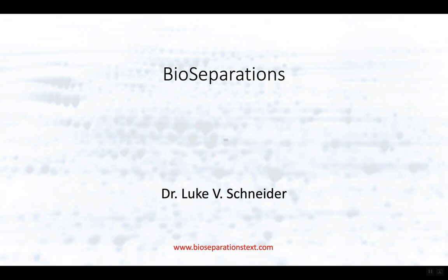But this is the inherent model of all electrophoretic processes. There are a lot of different varieties of electrophoretic processes. We're not going to discuss those here, but they are discussed in great detail in Chapter 11. Again, I encourage you to buy the book.